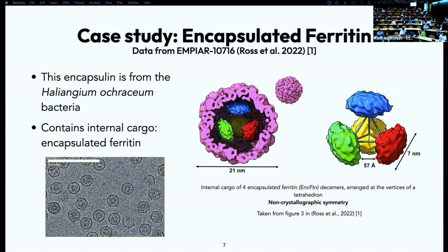That's great. And I just wanted to point out also that that's a big difference between resolution in something like X-ray crystallography and resolution in cryo-EM, where in crystallography, I think it is much more true that if you have a 2 angstrom map, you're getting a really sharp contour, and you might see a blur where this residue has this occupancy, or there are these different conformations, right? In cryo-EM, our resolution is a measurement. When we say resolution, we're talking about reliability, right? Up to this frequency, the half sets are the same. And so you can say these half sets very reliably have either an alanine or a threonine in this position. And you won't be able to resolve that using that map, like Ali is saying, because the images are just too bad for that to happen.